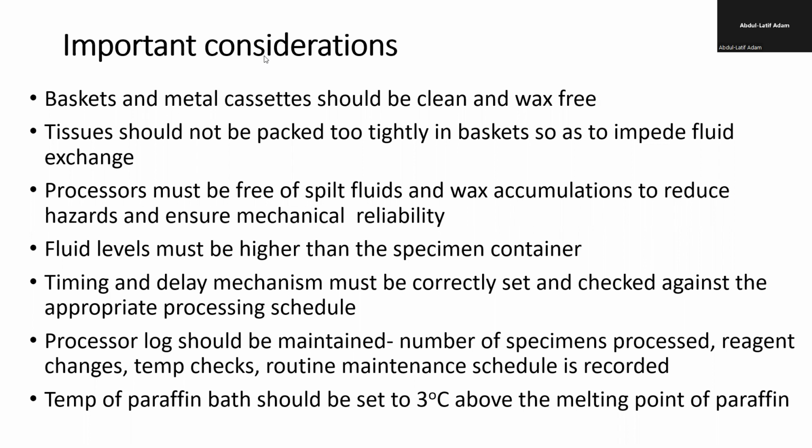Okay. And then you should also log the processing times, the time that you process. So somebody comes to take the logbook and knows that as soon as he is processing a sample, the person processes it from this time and it's supposed to end at this time. So that when the person comes and the sample is not at the right place, the person will be able to check and see, was there power fluctuating during the process, because of that there has been a problem, or maybe the processing is ready and the person has to take it out of the molten paraffin.